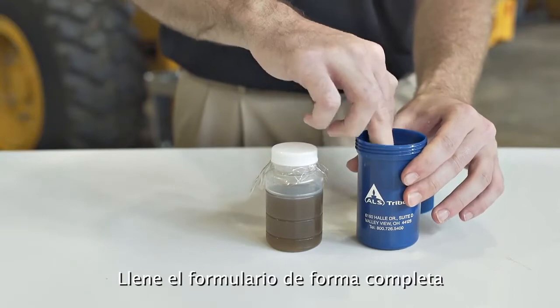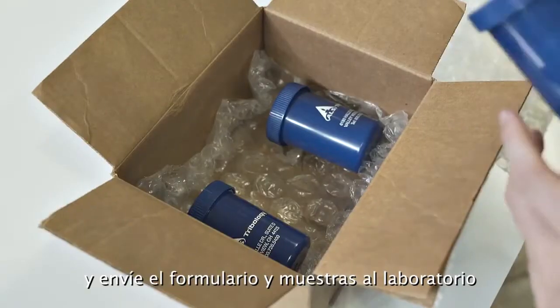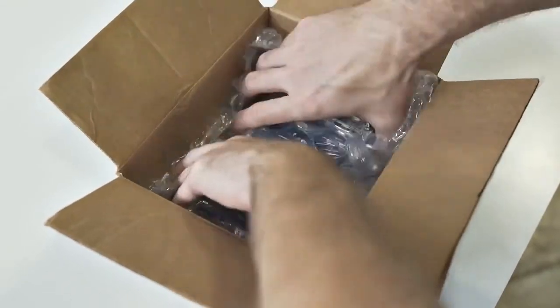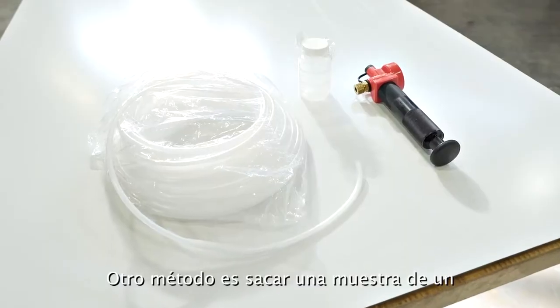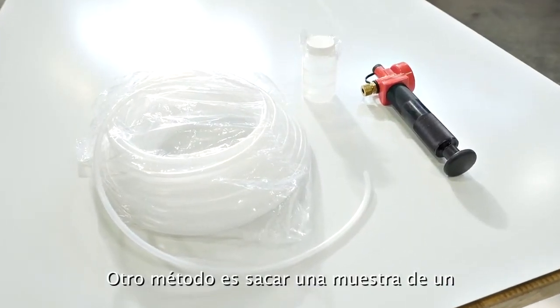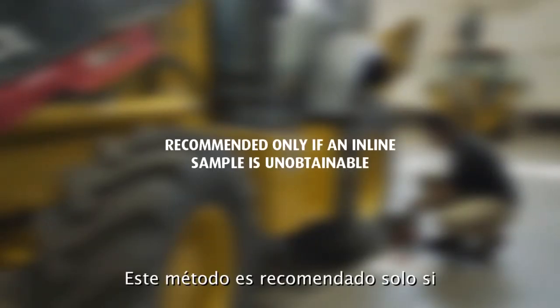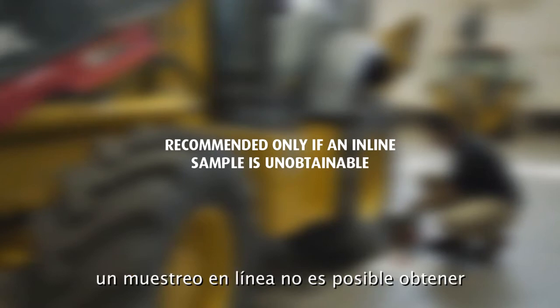Fill out the sample information form completely and submit the form and sample to the designated regional lab for testing. Another method is pulling a sample from a reservoir or sump using the vacuum pump with tubing. Obtaining a sample from the reservoir is recommended only if an inline sample is unobtainable. The fluid to be sampled should be warm and circulated for 30 minutes in order to obtain a representative sample.